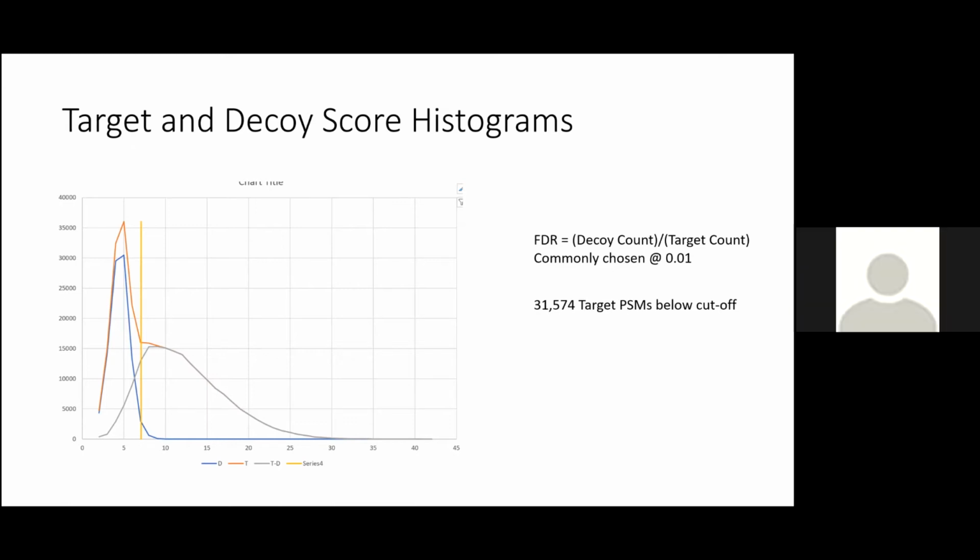No, I got it. Yeah, thanks. The other thing, maybe I don't know if it's relevant now, maybe you'll talk about it later. In practice, I saw that there are various columns for the intensities, so you actually compute various intensities. I spoke a little bit with Rachel about this, and she suggested, I proposed, to aggregate them all. What do you normally do with all those intensity columns? Do you take the best? Do you aggregate? Do you sum them, or what?